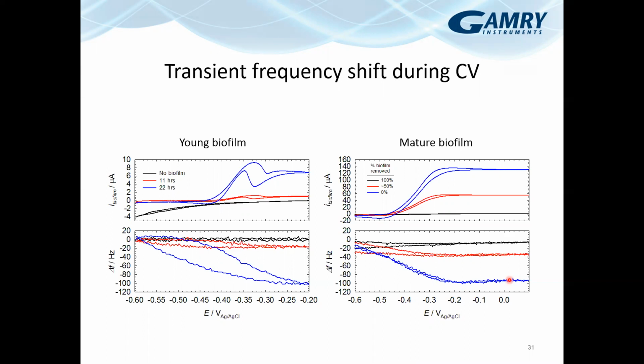This is very similar to how polyaniline and other intrinsically conducting polymers behave when you oxidize and reduce them, and dope and undope them. So this phenomenon is known and quantified in other polymer systems. When you're looking at biofilms and other biopolymers, it's comparable, but I don't know if the exact mechanism is known. So. Okay.